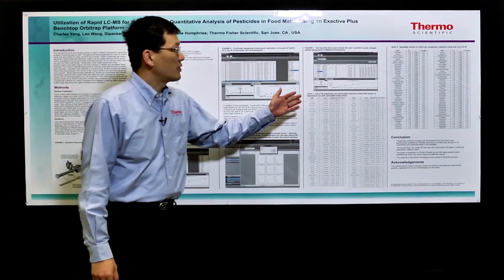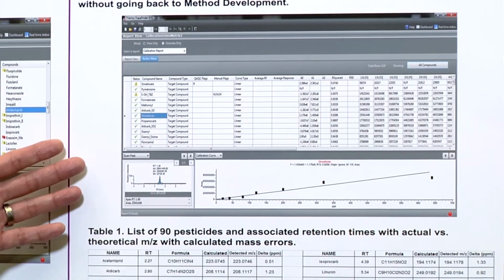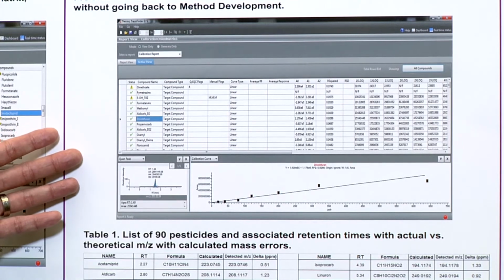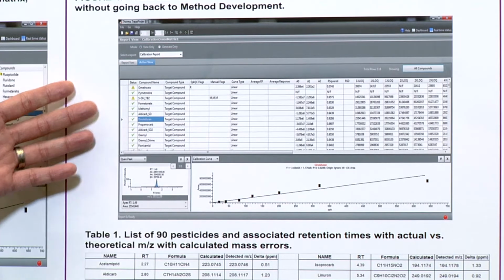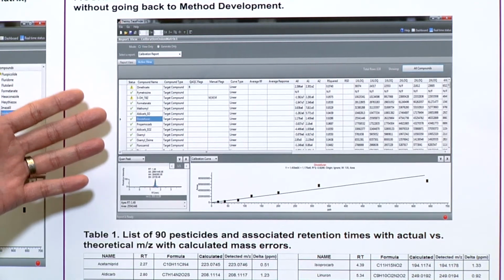Over here on this side, we basically have a special place in data review where we can look at all the data and be able to adjust parameters here prior to printing out the report generation. Once this is done, you basically have a quick way of reviewing everything.